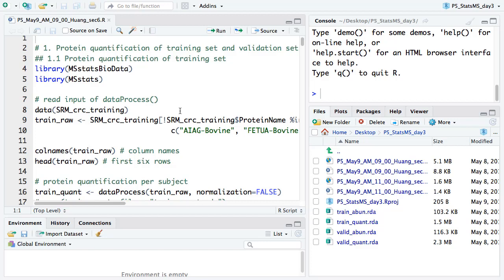In this script, we will see how — imagine you have your own dataset and you run MSStats or MSStats TMT, you have the protein abundance data matrix. We will show how you can do PCA analysis or make a heatmap plot. Today this hands-on session is mostly like a data analysis hands-on. Olga introduced the colorectal cancer case study in her lecture, and we will use exactly that dataset as our example.